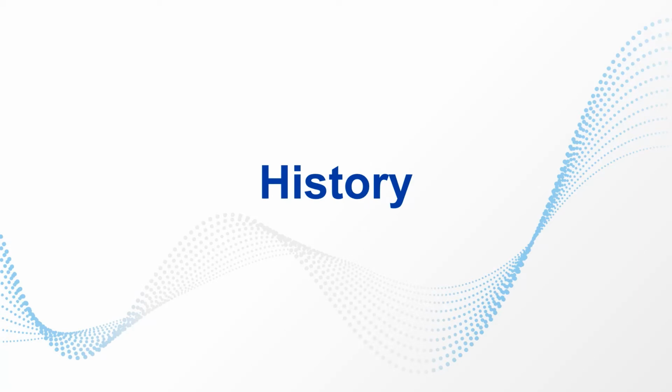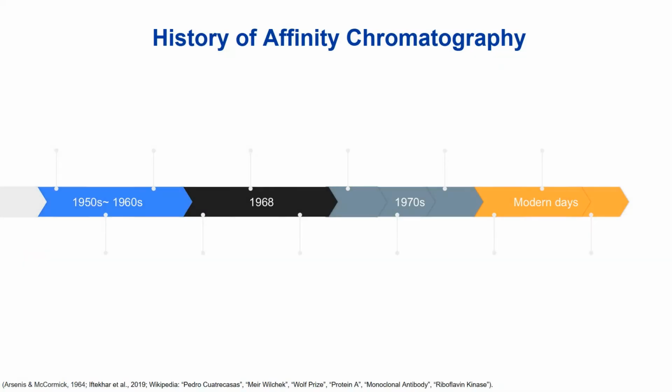I'm gonna explain to you about the history of affinity chromatography. So have you ever thought how to selectively separate your product after the production step of a bioprocess? Well, consider affinity chromatography as a great strategy. So I'm gonna tell you an interesting story about how affinity chromatography got to become so familiar with us these days.